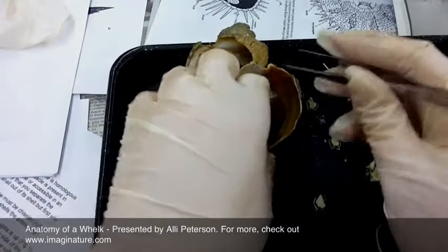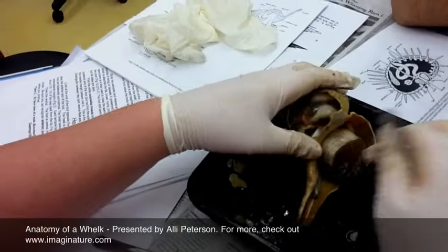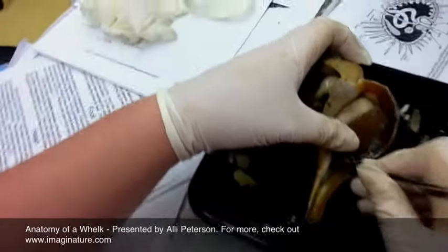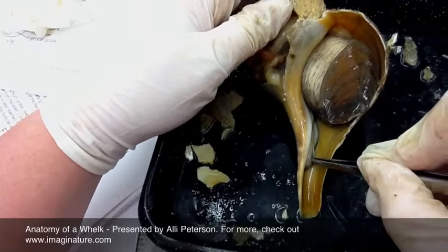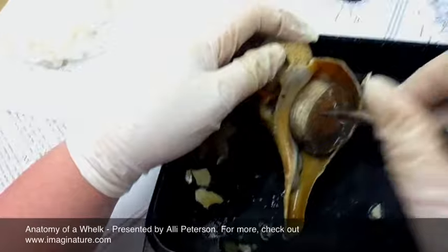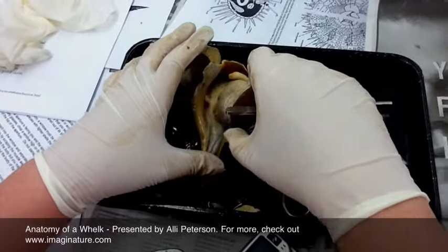We're going to pull the rest of the whelk out. This part right here is the siphon, and it will pull water into the mantle cavity for where the gills are located. We're going to pull the rest of the whelk out.